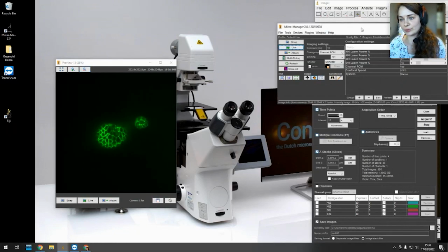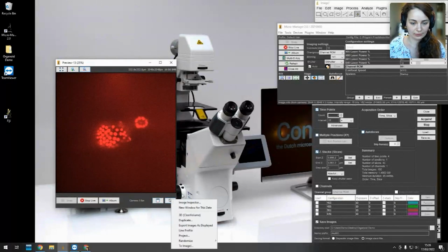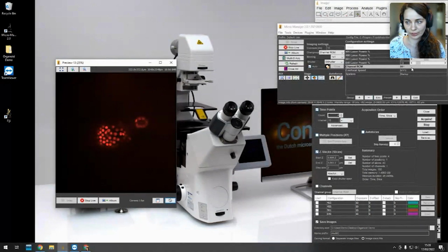So you can use the epifluorescent and also the confocal mode of the microscope. And also, after adjusting the laser power and the laser intensity, it allows you to use, of course, multiple channels. I will just quickly adjust the lookup table and improve the contrast. So this is the nucleus of the organoid.